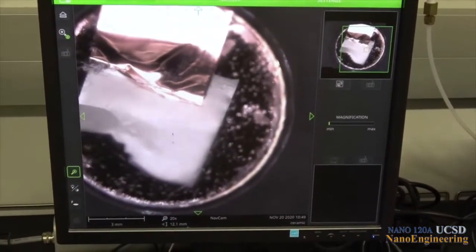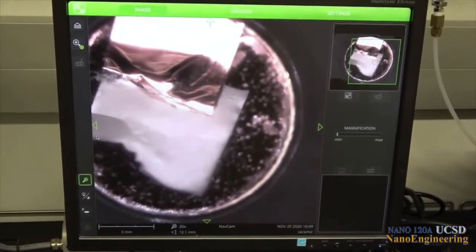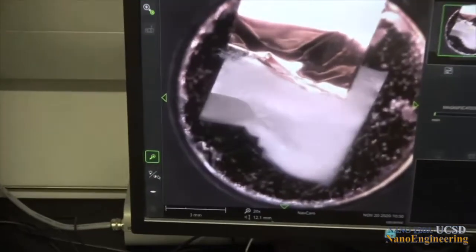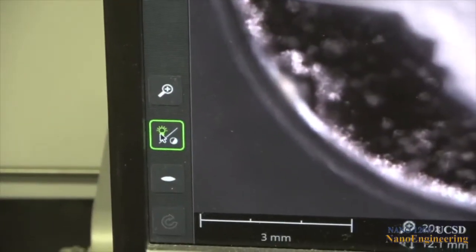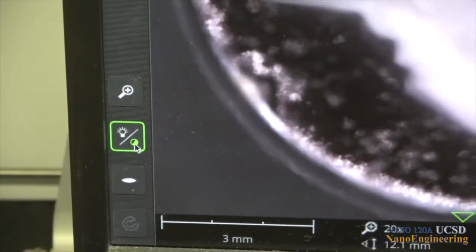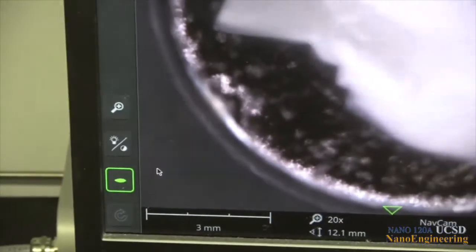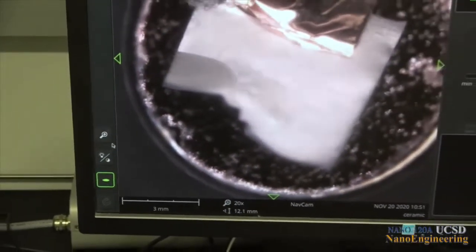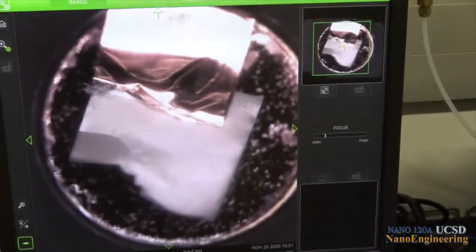The magnification, brightness, contrast and focusing options are located on the left hand side of the screen and are depicted by the magnifying glass icon, the light bulb icon, the half filled circle icon and the oval icon respectively. Each of these can be chosen by clicking on the icon of interest and the output of that control can be increased or decreased by turning this knob left or right. Further information on these controls will be provided later.